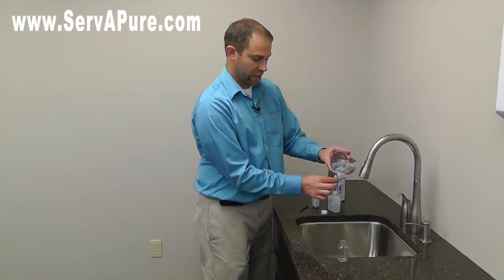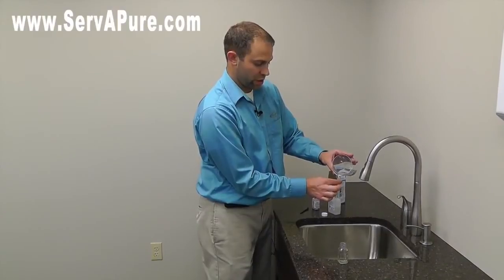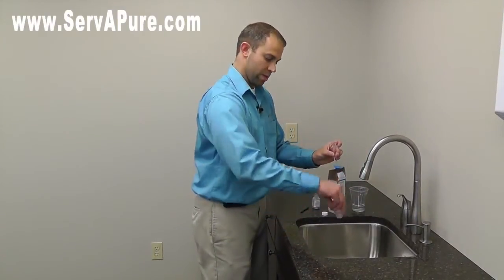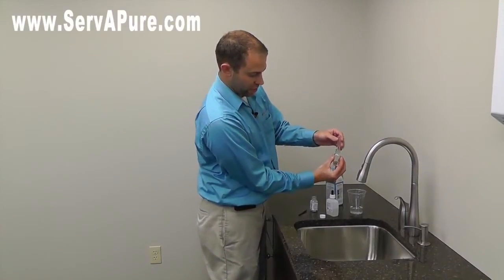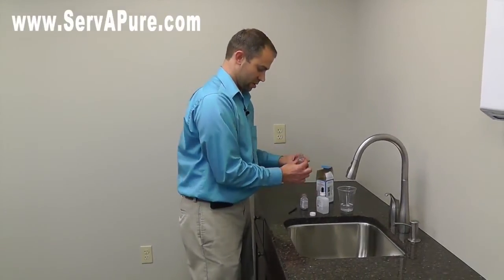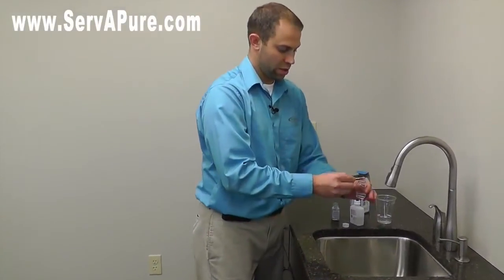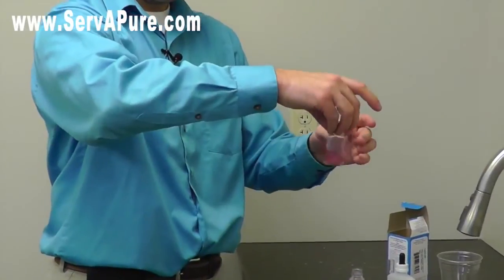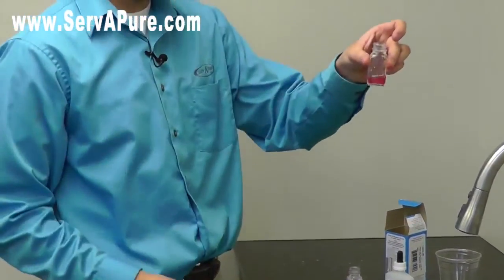Rinse the vial out a couple times, then fill it up all the way to the top as high as you can get it. Make sure the jar is empty and get all that sample right in that bottle. Shake it around a little, then add one level scoop of the reagent. Dump it in there and this time we don't get a blue or a purple — we get more of a pink color.